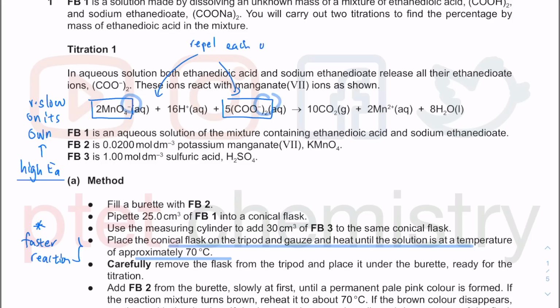Negative charges will repel each other. They have to collide. Collision frequency says your reacting particles have to collide. This will be unfavorable because they will repel each other. So high activation energy there, very slow reaction. But of course you can overcome activation energy by using high temperature. So what we are doing is applying high temperature to make it react at a better rate, something that you can see with the color changing from purple to a permanent pale pink color.